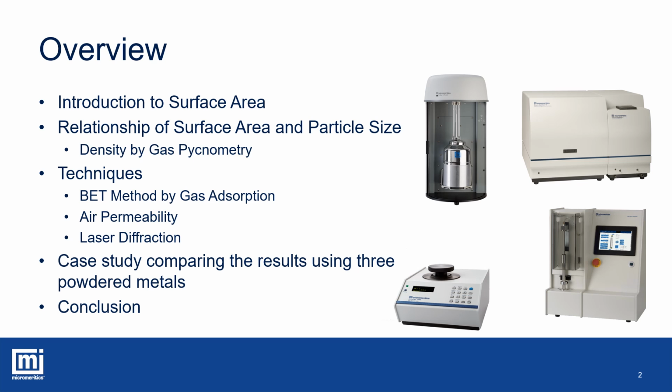I'll start with an overview of the topics that I'll be discussing today. I'll start with an introduction to surface area, and then discuss the relationship between surface area and particle size. In order to do this, we'll need to use density values. So we use gas pycnometry to calculate the density.